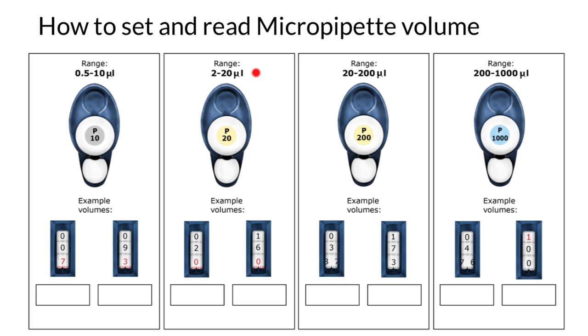For example, P20, the range is between 2 and 20 microliters. We only can work with this range. P200 between 20 and 200 microliters. And P1000 between 200 and 1000 microliters. 1000 microliters, as you now know, equals one milliliter.